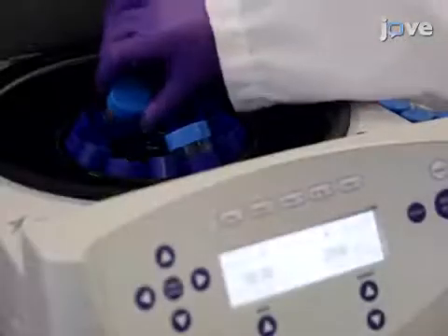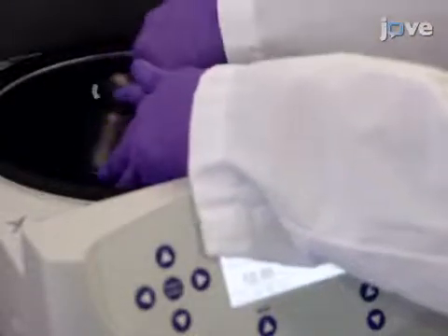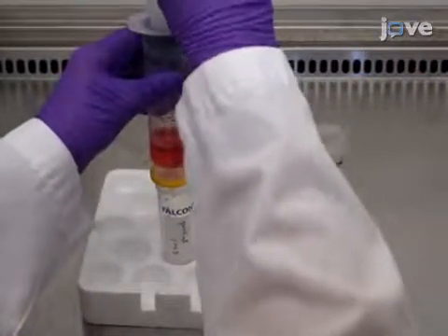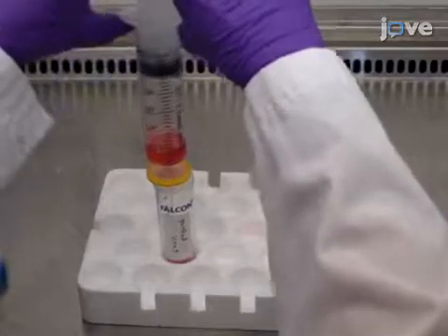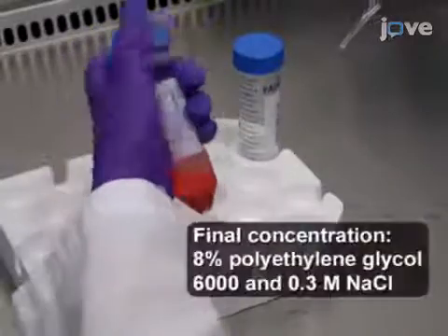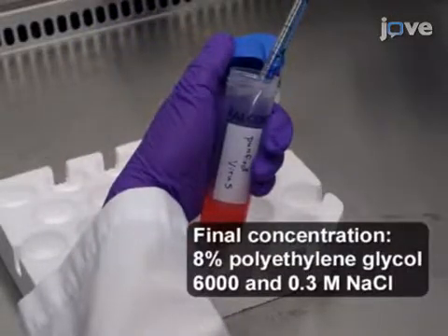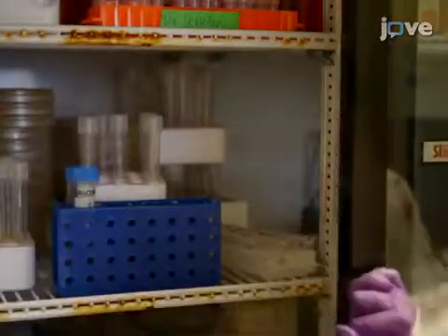In this step, centrifuge the viral supernatant at 2,000 times g for 10 minutes. Afterward, purify the viral media by filtering it through a 0.45 micrometer low protein binding syringe filter. Next, add 5x polyethylene glycol 6000 solution to the media. Invert the tube several times to mix. Then incubate the viral mixture at 4 degrees Celsius for at least 12 hours.